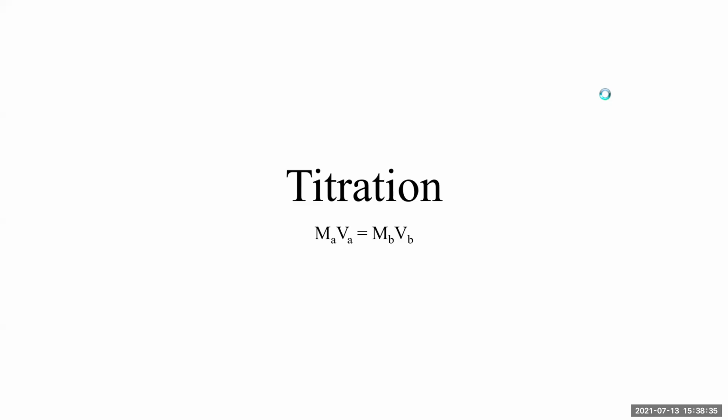In this video, we're going to talk about titrations and the titration experiment. Titrations are a way of figuring out what the unknown concentration of a solution is based on its reaction with a known solution. Most of the time, this will be in the context of an acid-base neutralization reaction. But sometimes you can actually do this with other kinds of solutions as long as the moles of one reactant equal the moles of another. So the molarity of one solution can be equated to the molarity of another one.